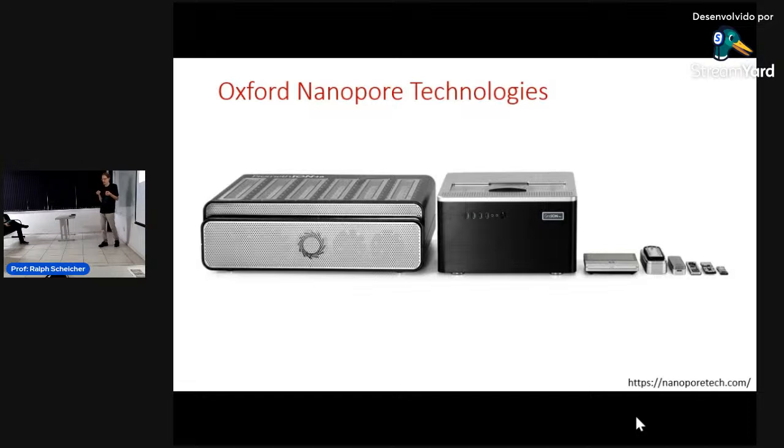Now, actually, nanopore DNA sequencing is already a reality, but they're not using the systems that I've shown you here so far. There's a company, Oxford Nanopore Technologies in the UK, which in 2012, 2013, brought something on the market which can actually sequence DNA with nanopores. And they have since then, so this was 10 years ago, improved the technology even further. So now it's really a strong competitor compared to other DNA sequencing methods out there on the market.